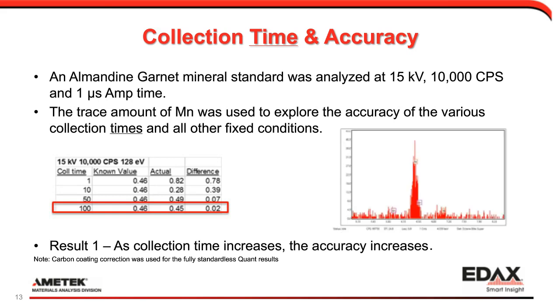And to illustrate what we're looking at when we're dealing with the different spectra, the first one that we see here is just the simple 1 second collection time. This is what I would consider a very low collection time for the lower count rate. And at 1 second and 10,000 counts per second, you can see that we have very sparse data. The peak that we're looking at is the iron K alpha peak. Just to the left of it is the area that we would expect to see manganese. And if we're measuring a trace amount of manganese, the 1 second visually confirms that certainly the greater difference is understandable.